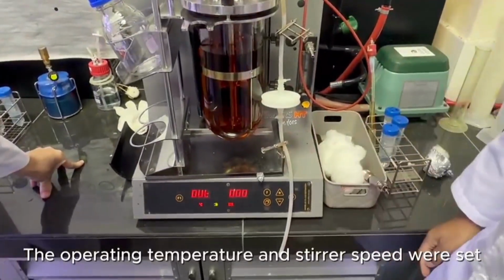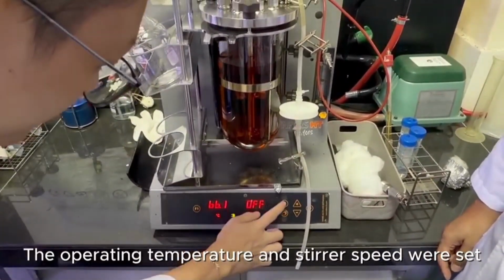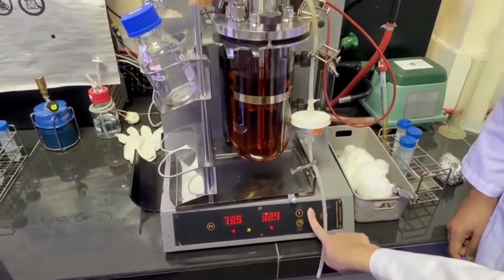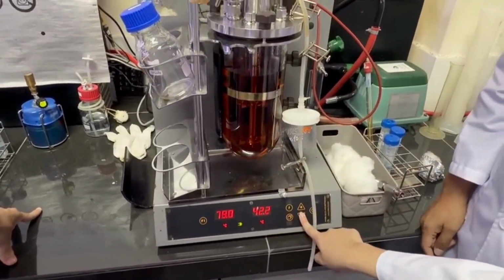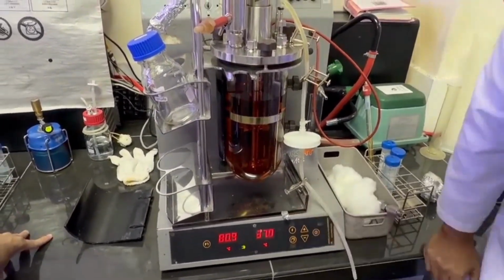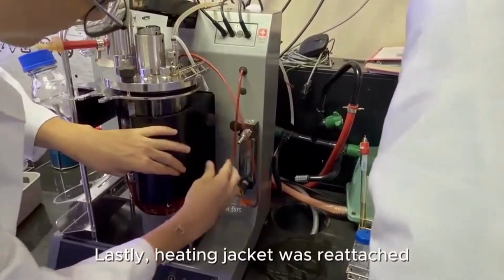The operating temperature and stirrer speed were set. Lastly, the heating jacket was reattached.